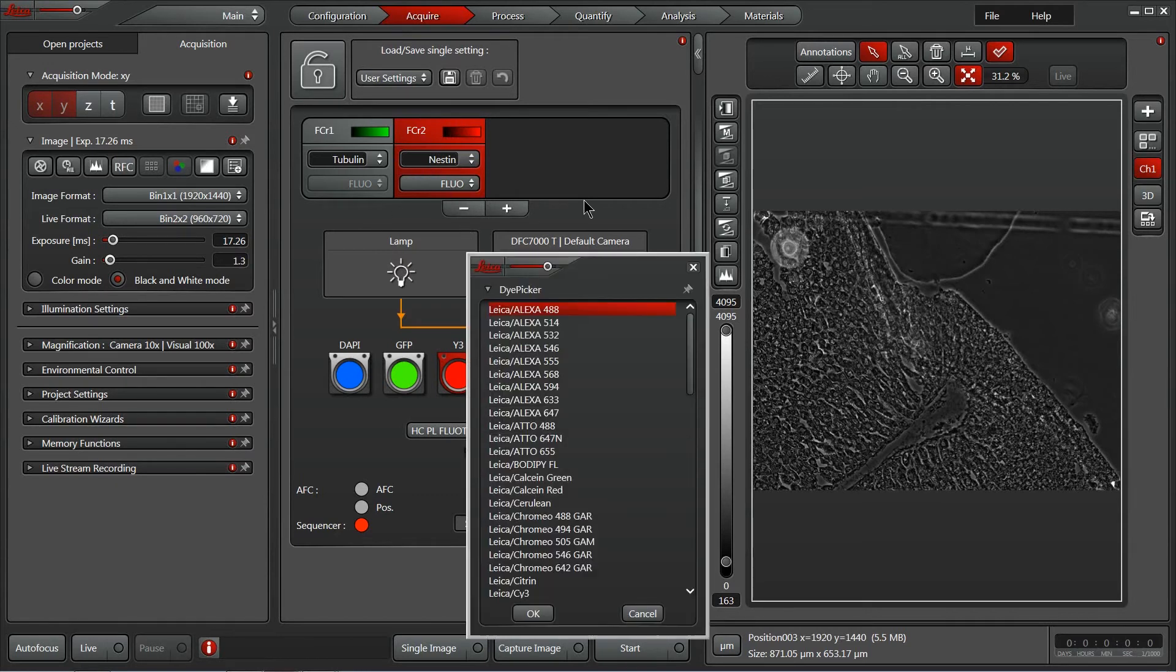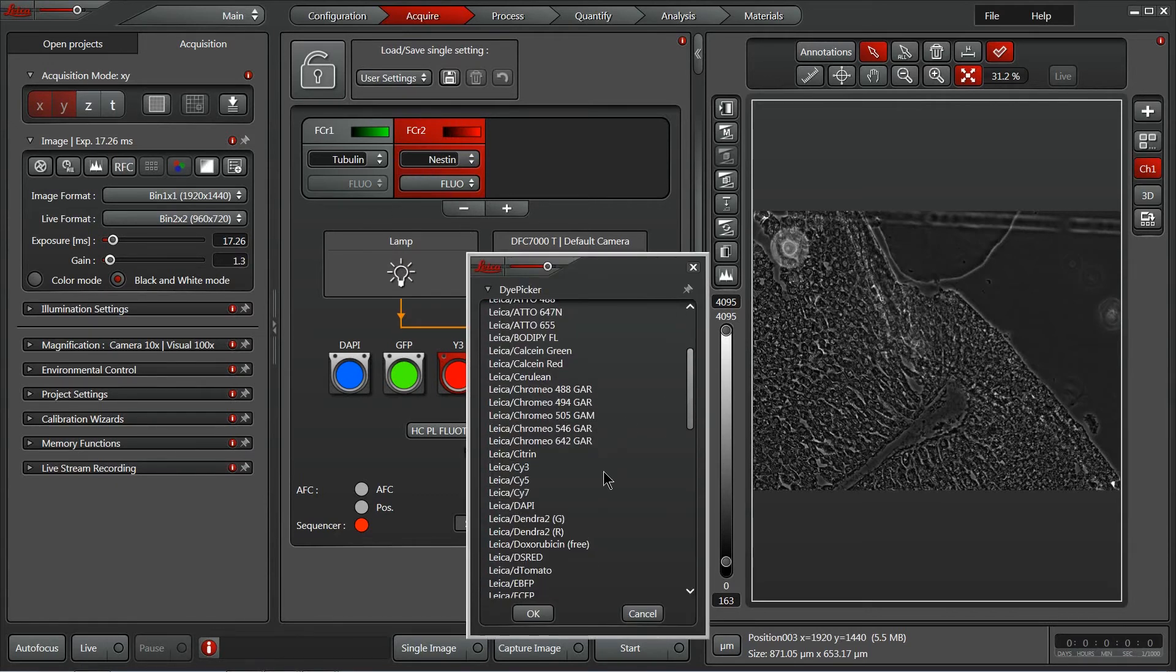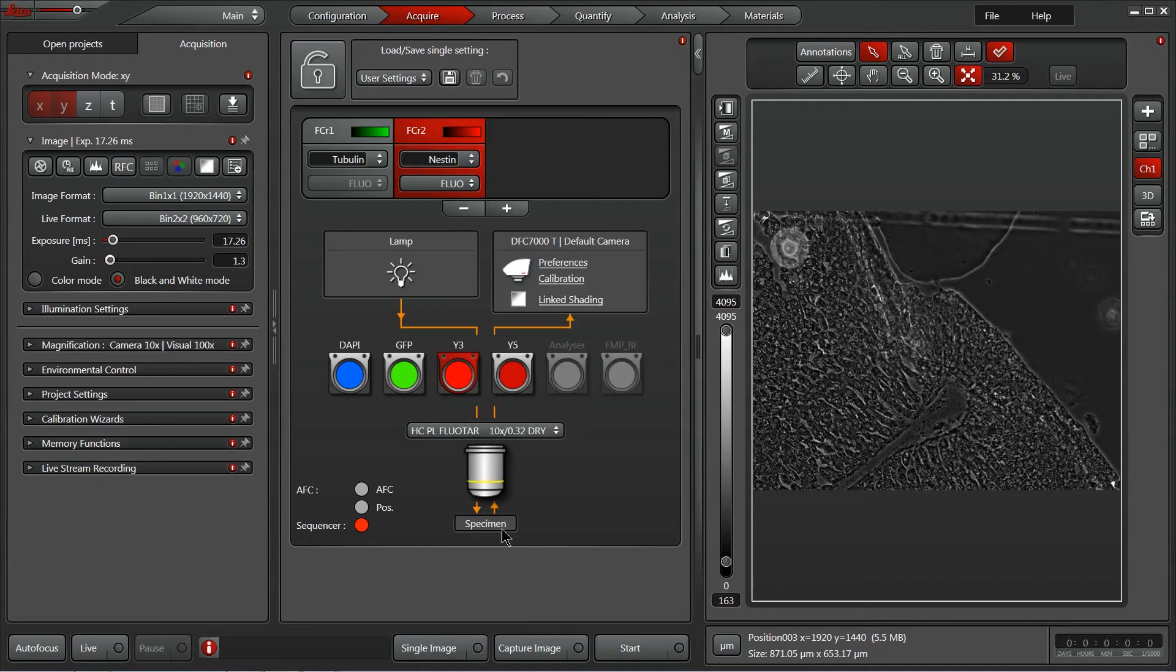Right-click, go to properties, and select Cy3 for this particular one. Great! So now I've got two channels set up.